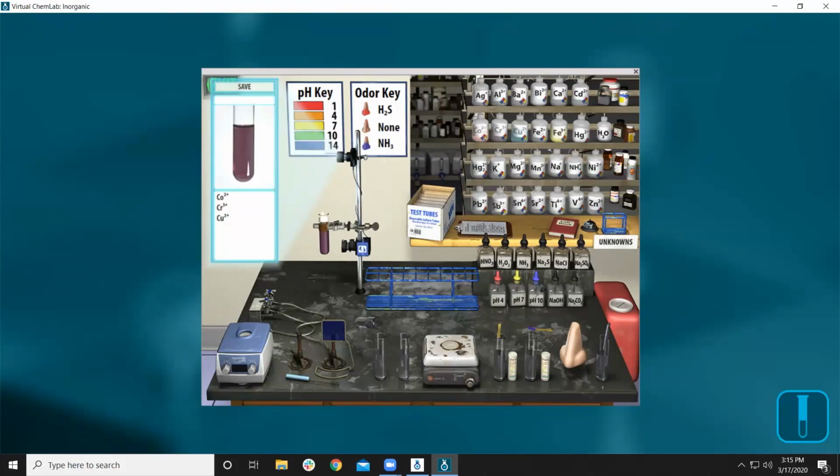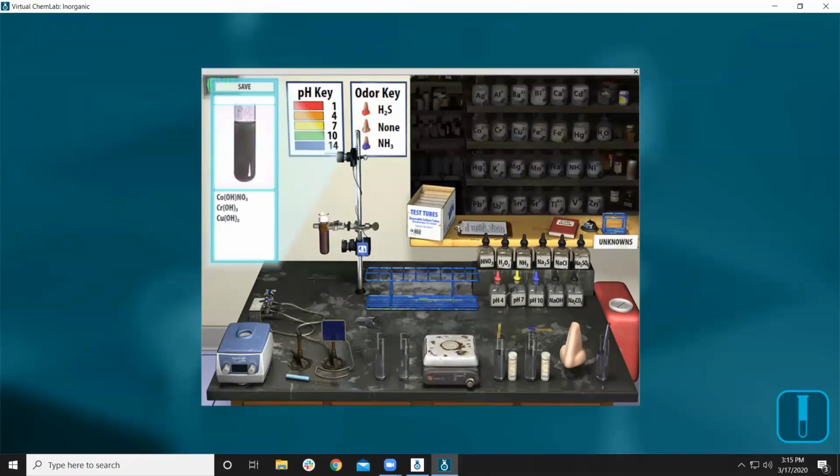But we devised an algorithm based on real data. So we took the chemistry of all of these and measured all of that chemistry. So if I add pH 10, look what happens. What if I go to pH 4? Dissolve the precipitates. Go to pH 10, I get precipitates. I'm going to centrifuge it. There I force it to the bottom.